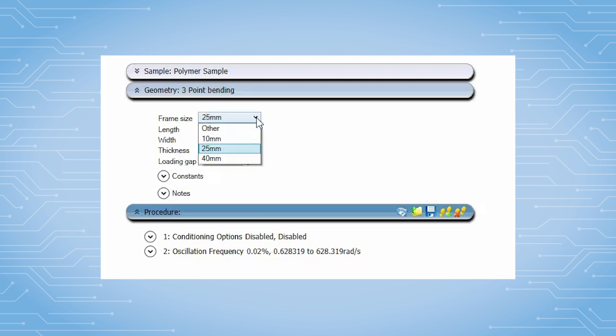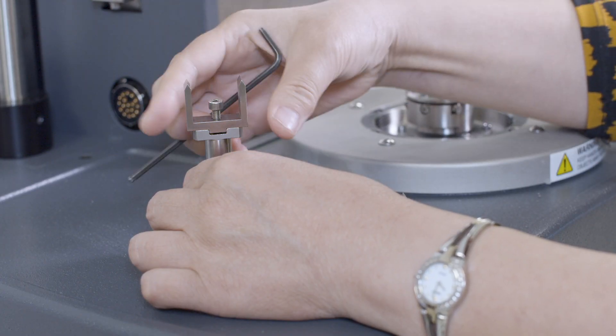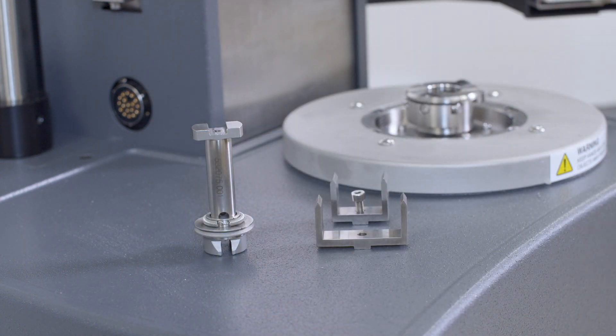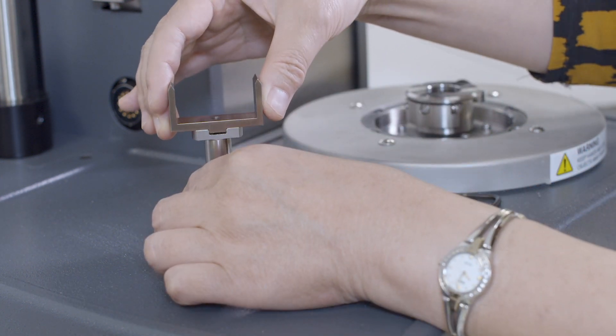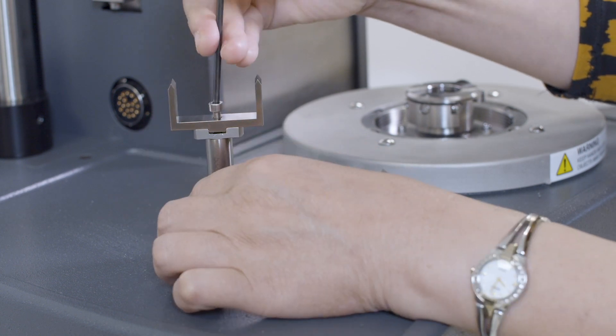To ensure an accurate bending test, the sample length to thickness ratio needs to be equal to or greater than 10 to 1. Since this sample thickness is 3.2 millimeter, we shall select to use the frame size of 40 millimeter for the measurement.